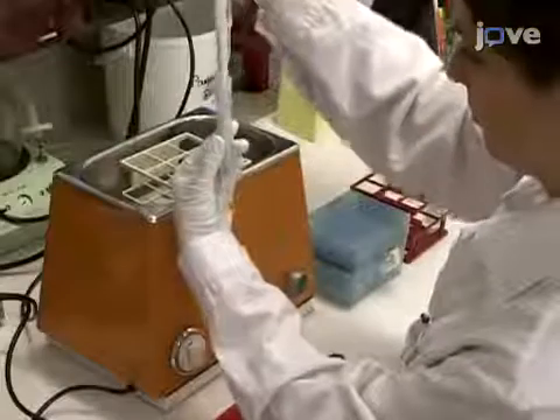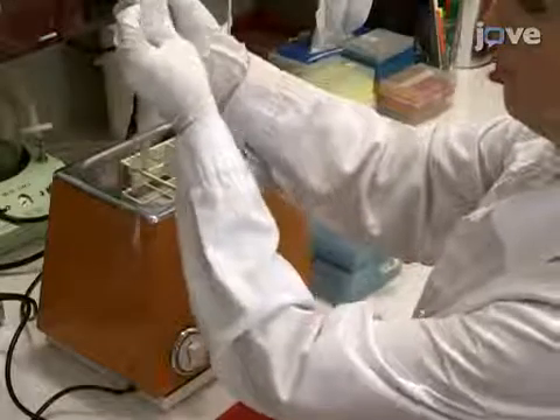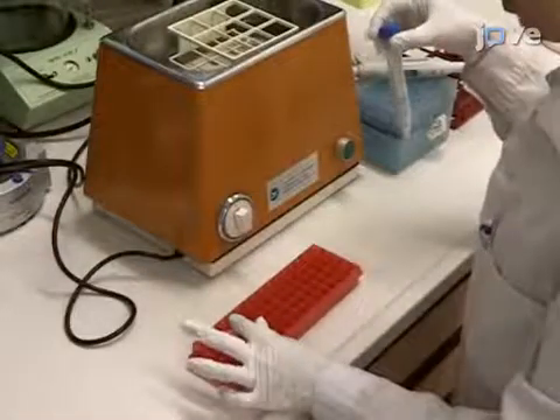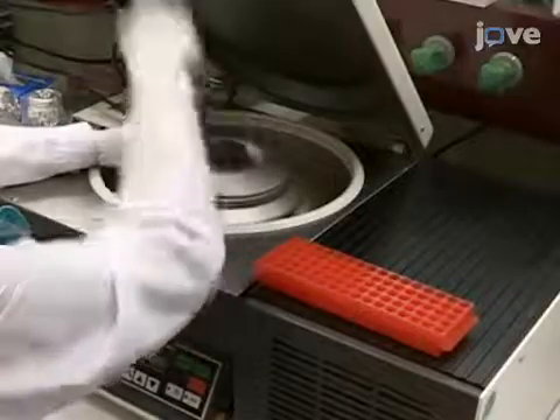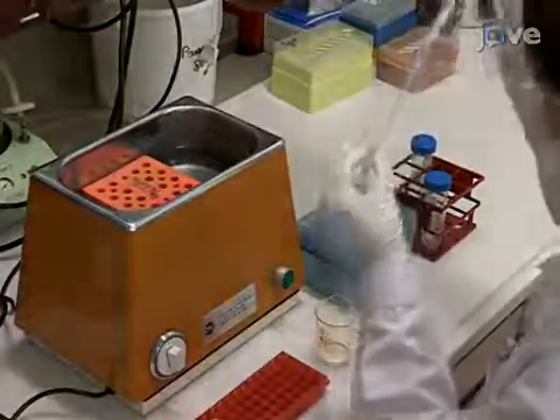Then, transfer 500 microliters of the resuspended zymosan to two 1.5 milliliter tubes and centrifuge them at 11,000 Gs for 5 minutes. Repeat the wash with 500 microliters of PBS.